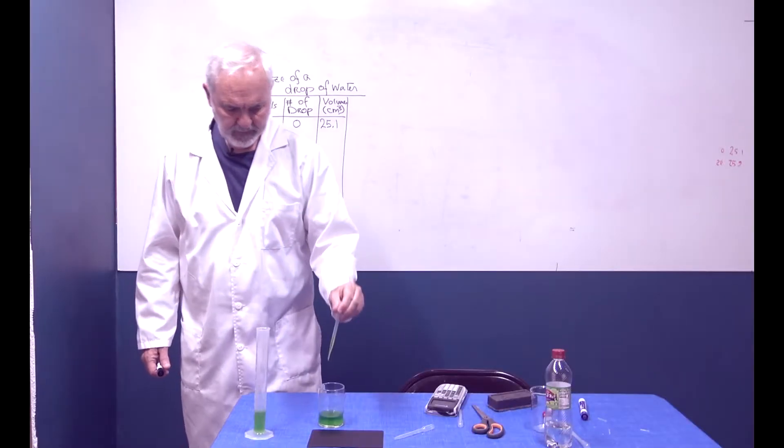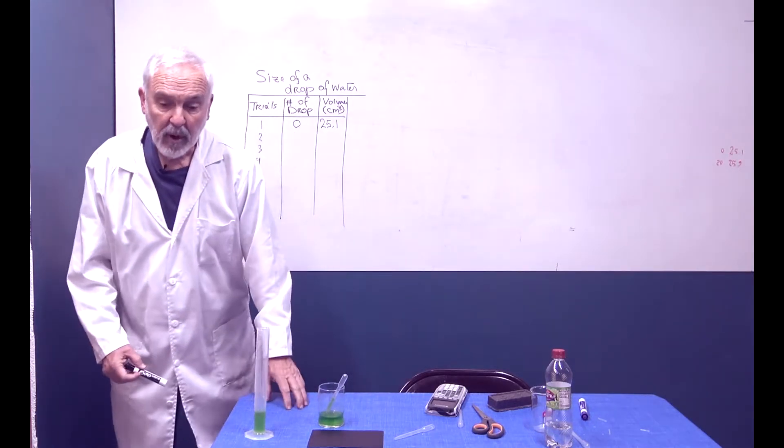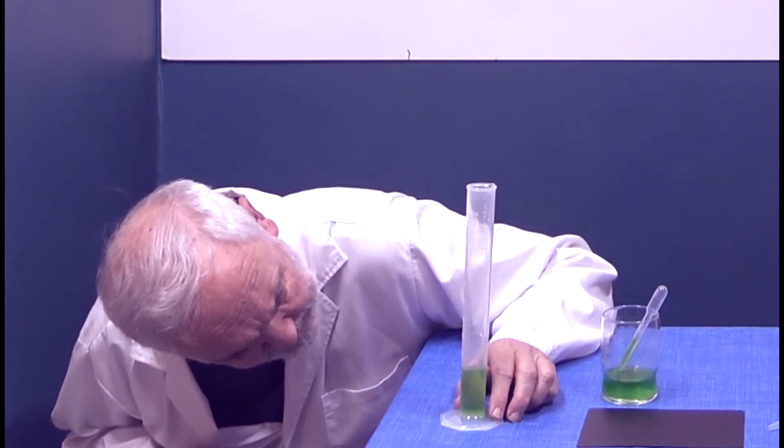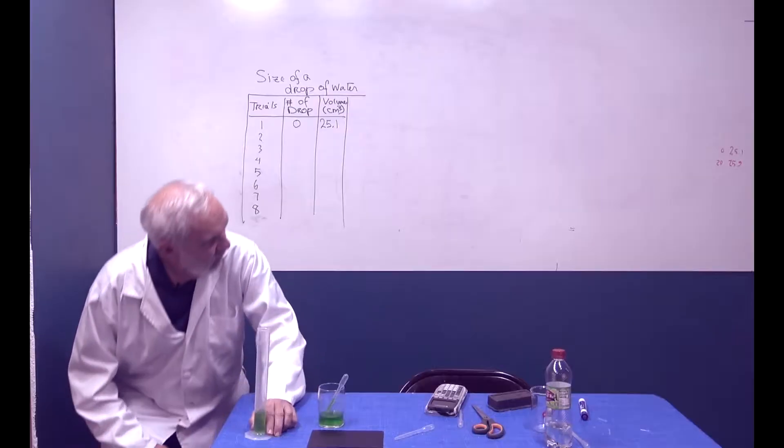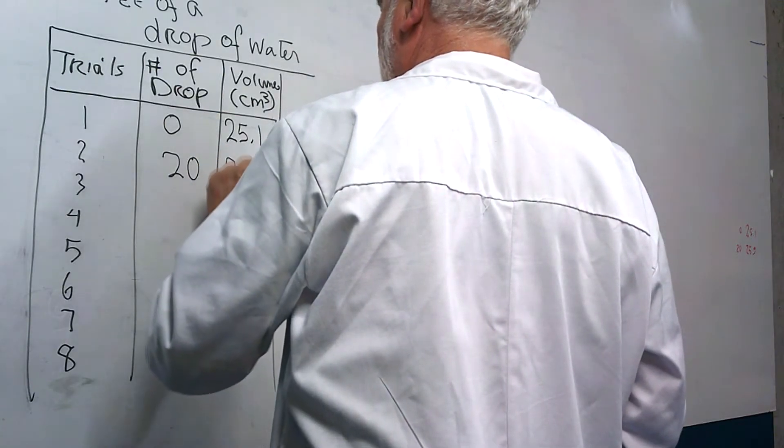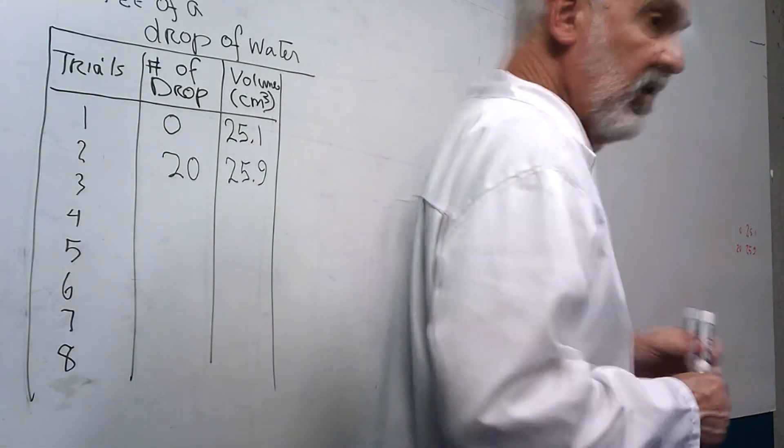1, 2, 3, 4, 5, 6, 7, 8, 9, 10, 11, 12, 13, 14, 15, 16, 17, 18, 19, 20. It doesn't matter how many drops I add, I just have to know how many drops I add. Let's get my eye down to the level. We have, it looks like 20 drops, 25.9 cubic centimeters.